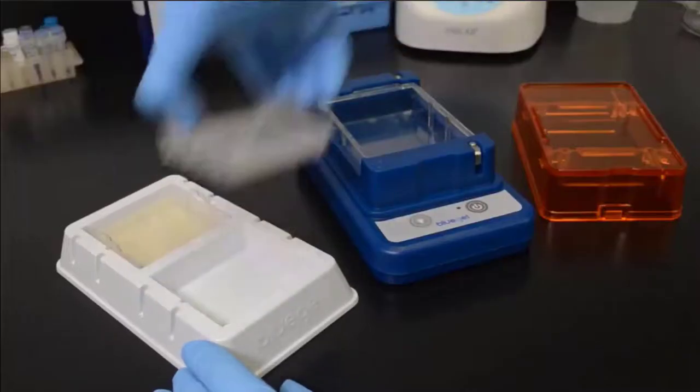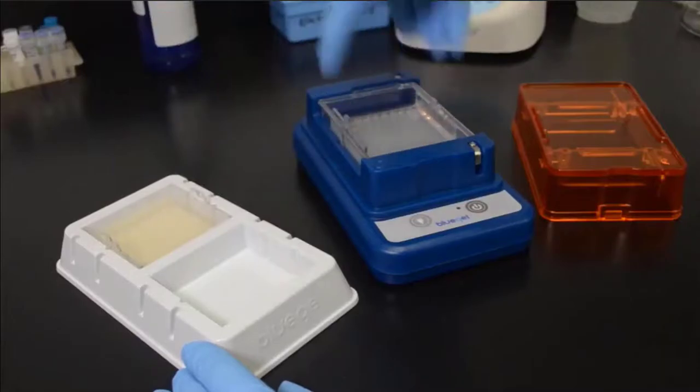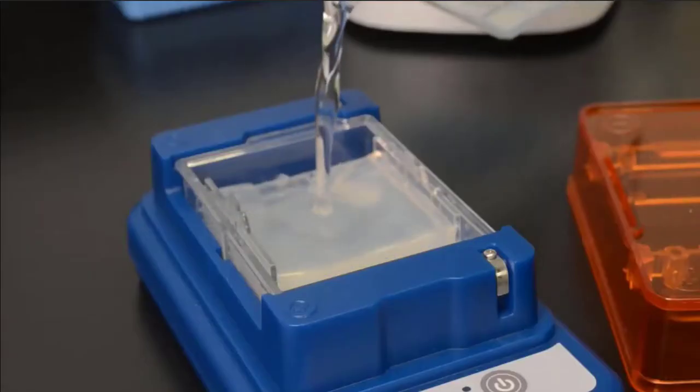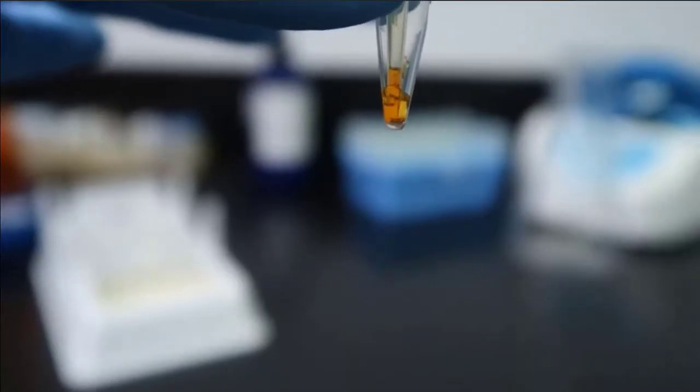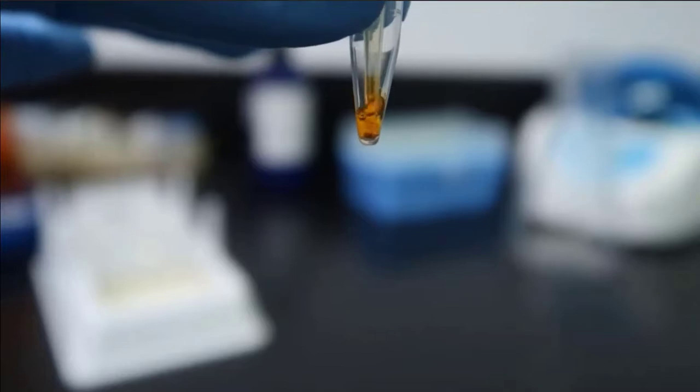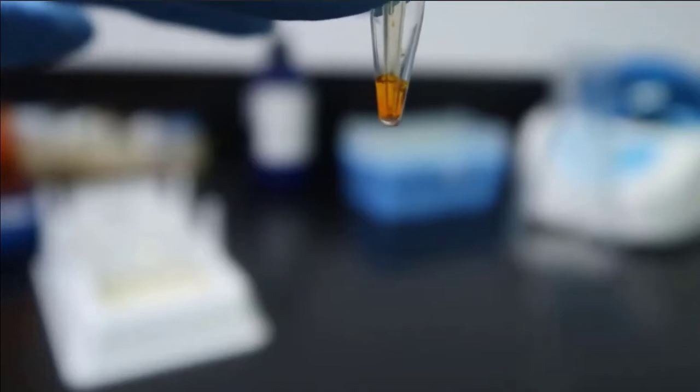When the gel is cooled, we place it into a gel electrophoresis chamber. We cover the gel with running buffer, which helps to conduct electricity. Before adding a DNA sample to our gel, we mix it with a loading dye, though often this dye is already added. This dye is more dense than the running buffer.